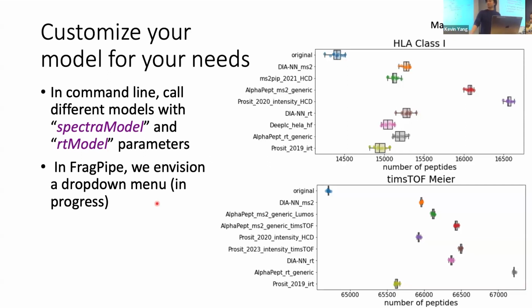Yeah, so the idea behind MSBooster is that it'll also try to rescue these PSMs that originally weren't good enough. So for example, if its database search score was pretty poor because maybe not all the fragments were there, then initially maybe you weren't capturing that. But with MSBooster, you see that even with the fragments that it is expressing, those intensity ratios are quite accurate, then maybe you'll save that. I haven't shown any plots in terms of the number of proteins identified, but we do get a lot more proteins as well. So yes, it is rescuing these false negatives as well.